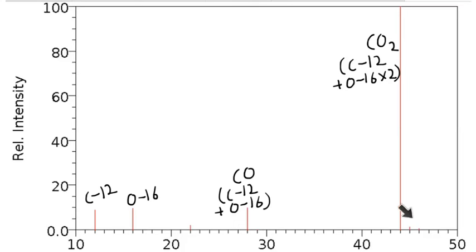We've also got a couple of little heavier peaks, so we can explain those by saying that it's CO2 with a molar mass of 45 or a molar mass of 46, so maybe there's oxygen 17 or maybe there's a carbon 13, something like that. That's a little bit weird because we don't see any here, but maybe there's just sensitivity problems or I don't know what.